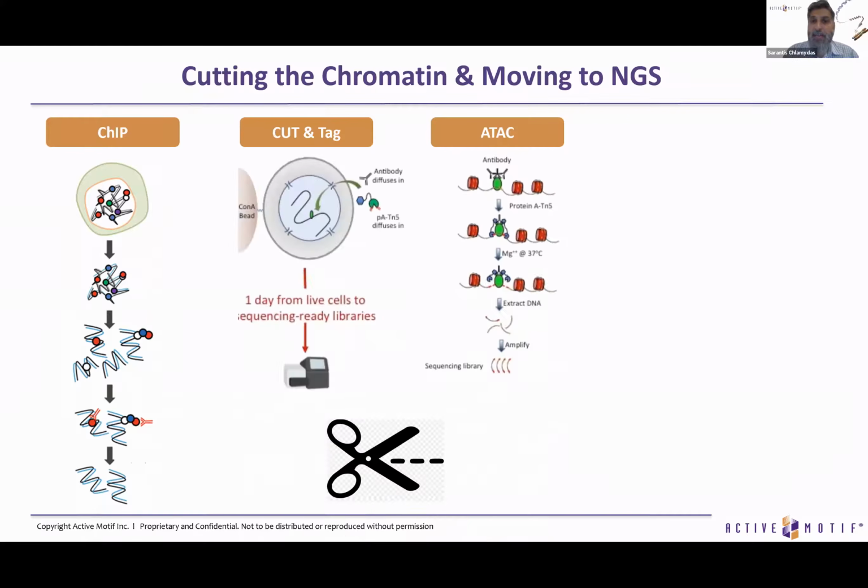The new version is CUT&Tag, where we don't use fixation. It's not a fixation-based protocol. It's native conditions. We immobilize cells and nuclei with concanavalin A beads, and we use protein A fused to Tn5 transposase to integrate sequencing adapters at the regions where my protein is located.